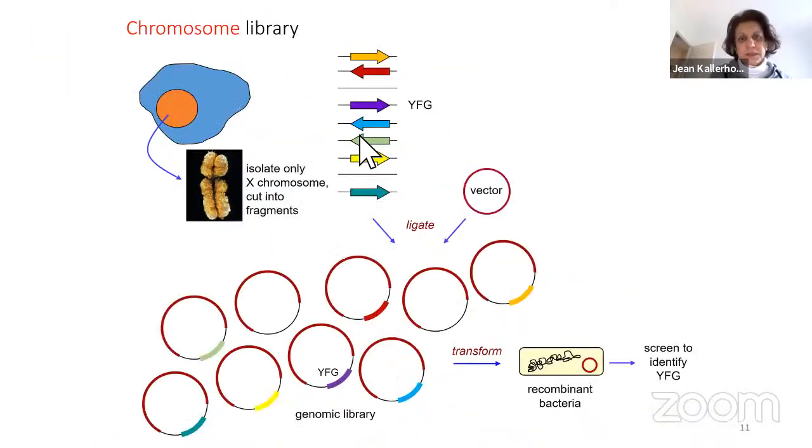So you integrate bits of chromosomes randomly into a population of plasmids, and therefore you will get a population of recombinant bacteria. And you have to have tools to identify the potential ones. And the two tools I'm talking about to you today are, one, selectable marker genes, and two, reporter gene.